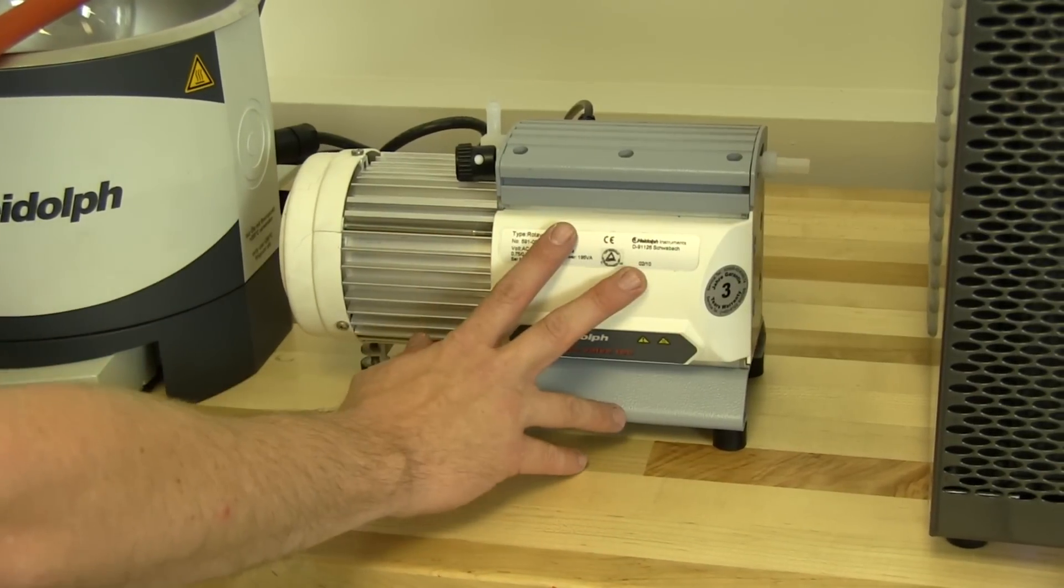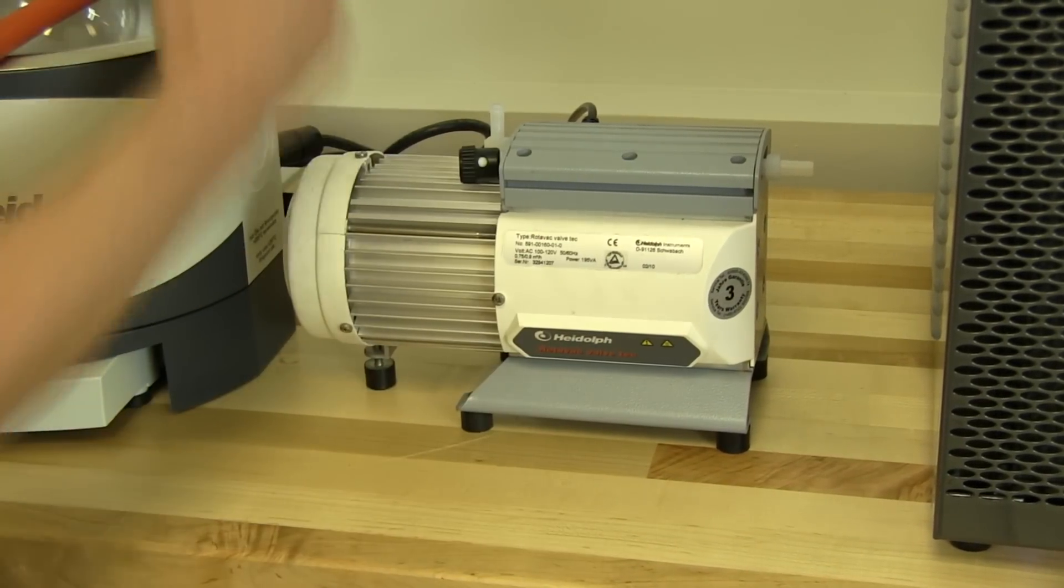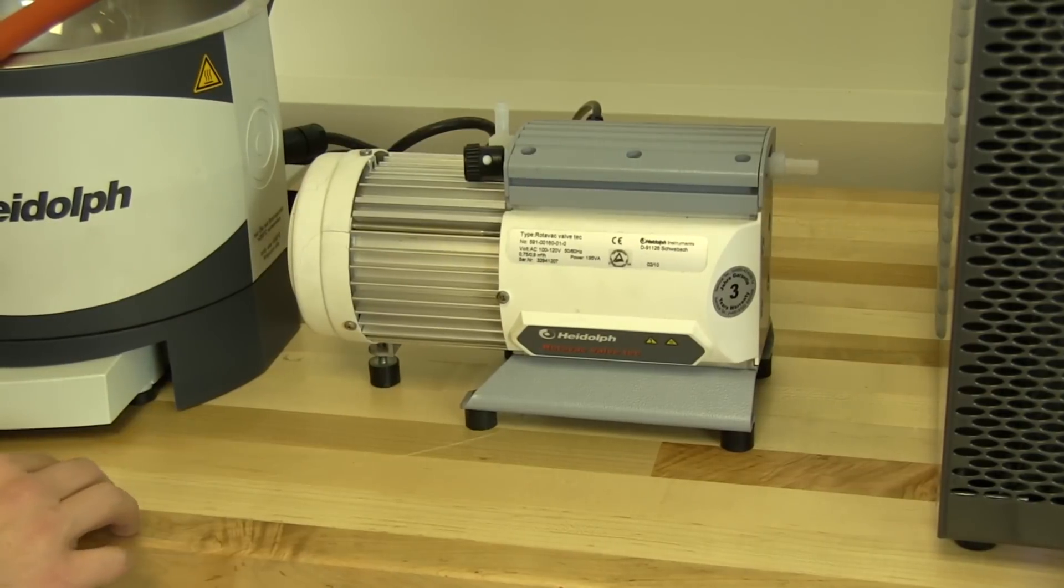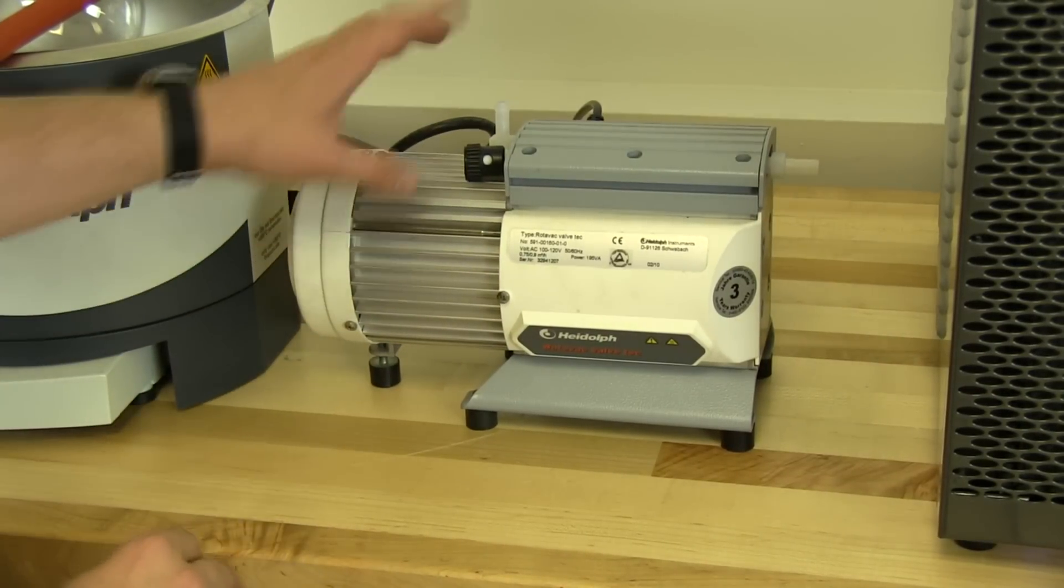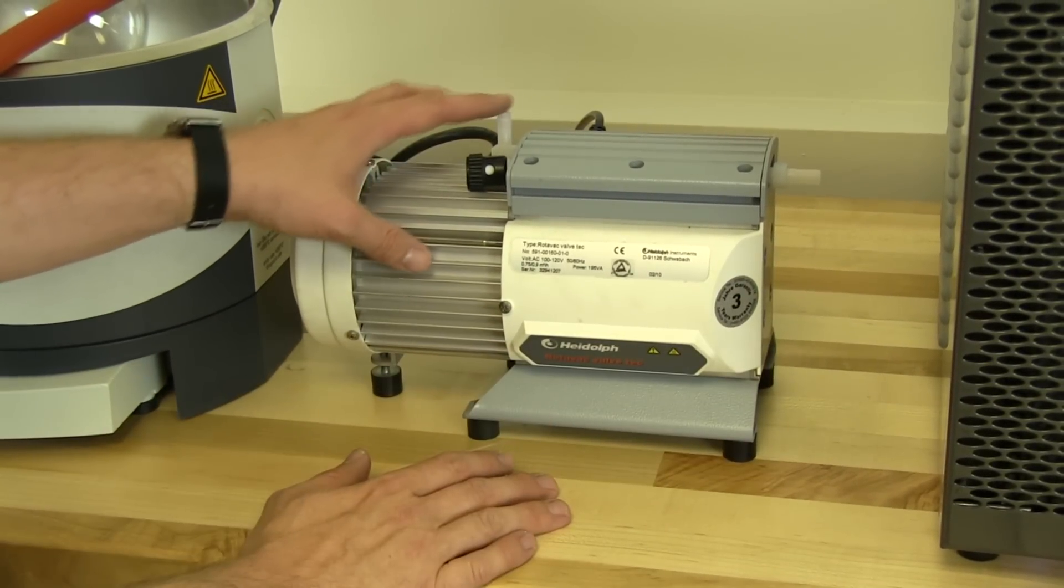This can go anywhere. This can go underneath the table, behind, or on top of our chiller over here. But what you want to make sure is that you have the inlet and outlet closely identified.